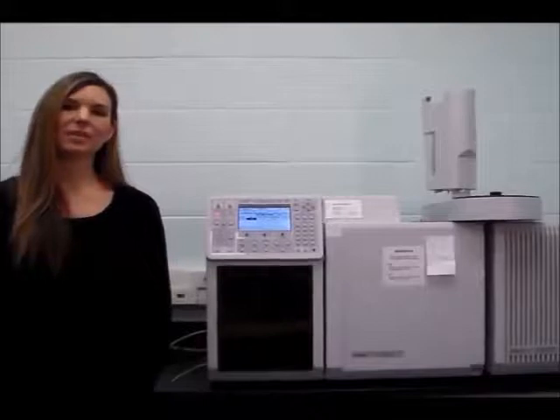Now we're going to look at our three instrument rooms. This instrument is a GC mass spec used to analyze components in a gas mixture.